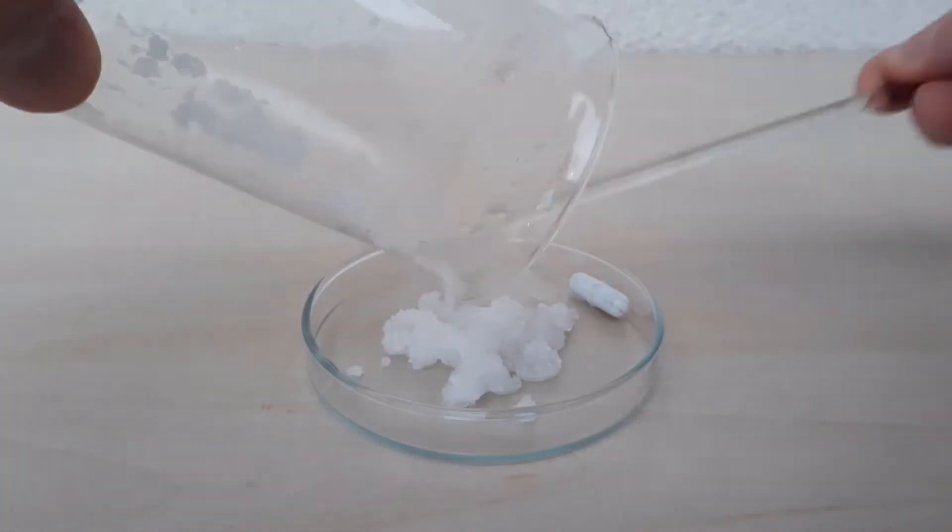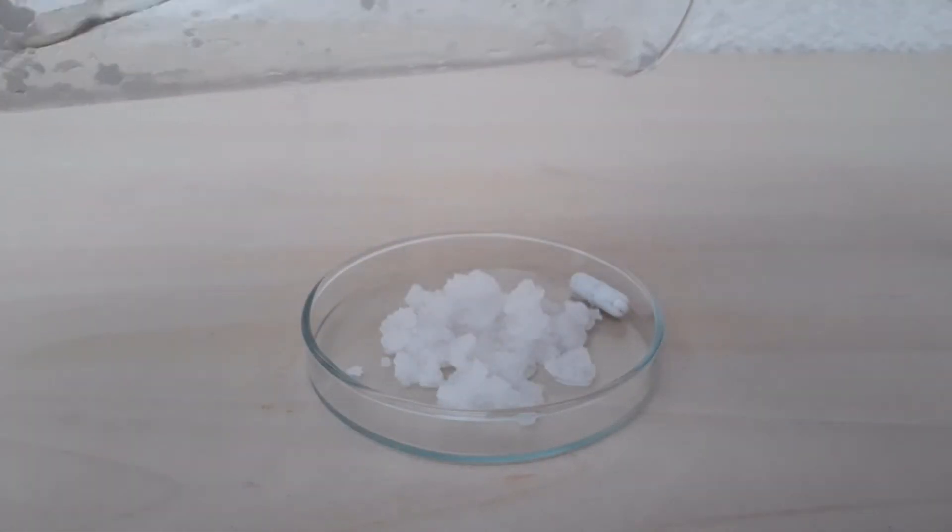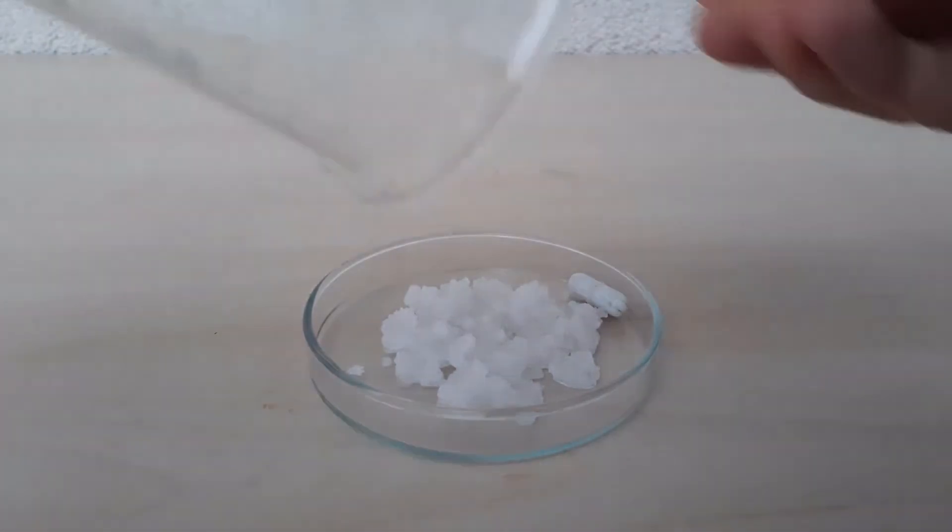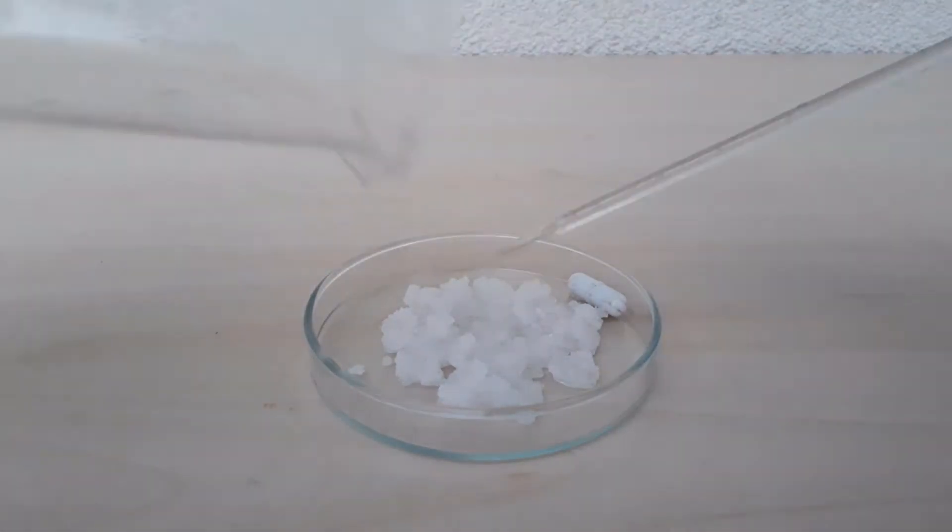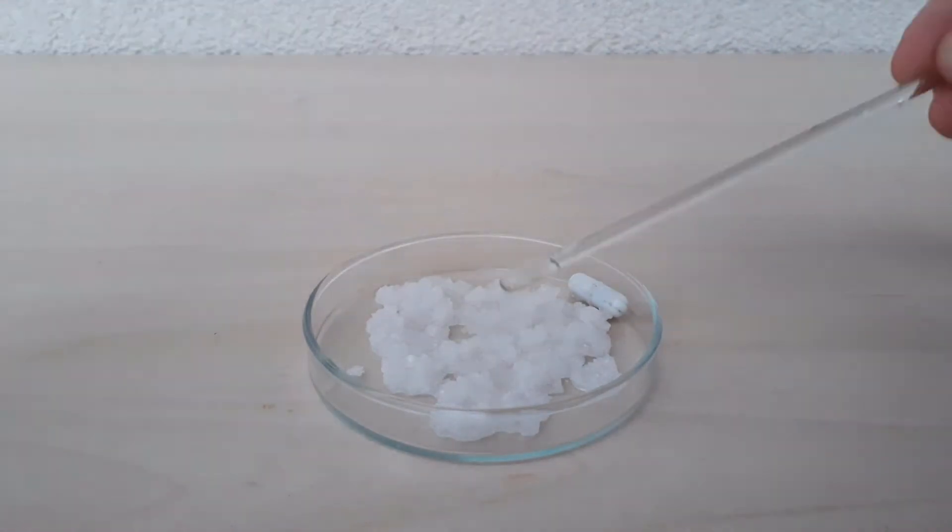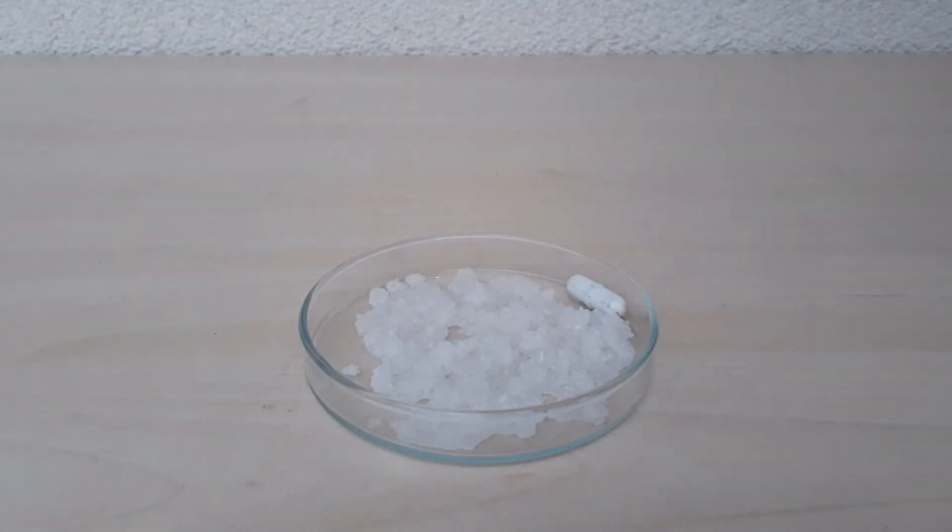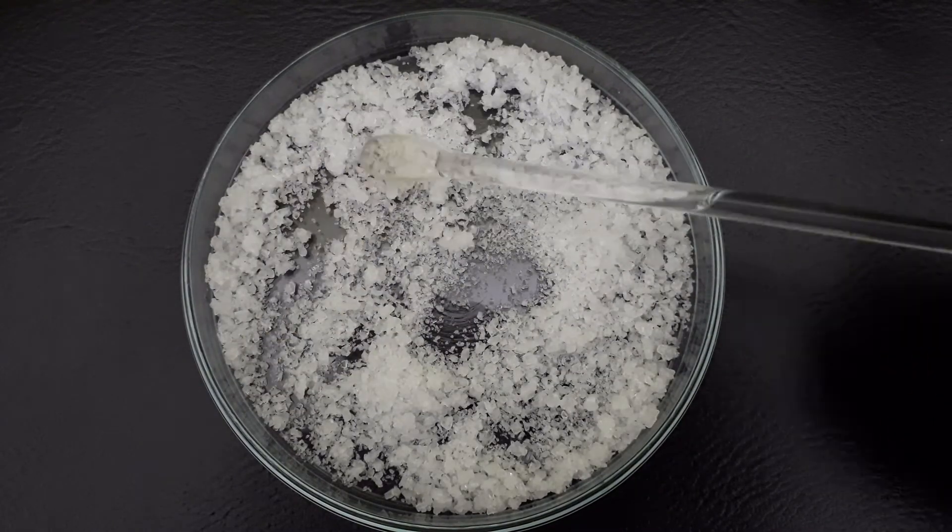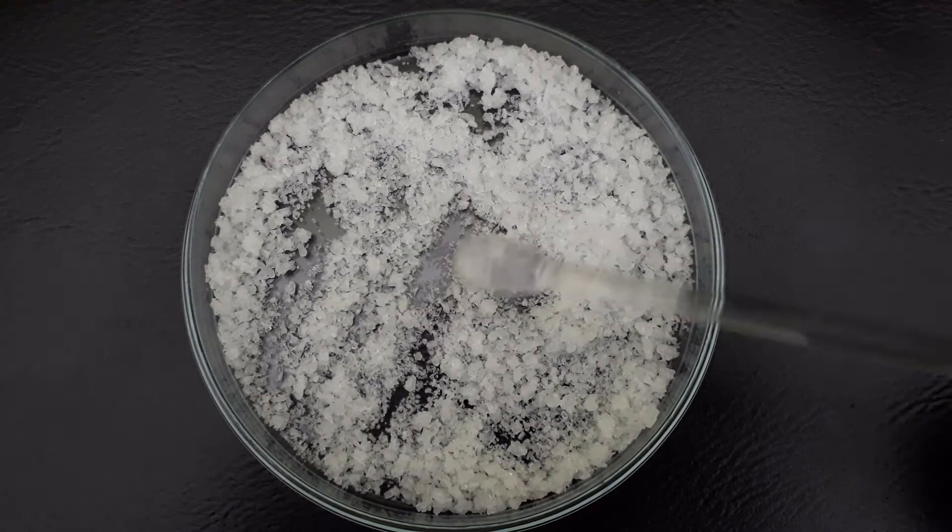I scraped out all of the formed crystals onto this Petri dish and let the rest of the water evaporate. In the end the yield is 20 grams of nice potassium sulfate.